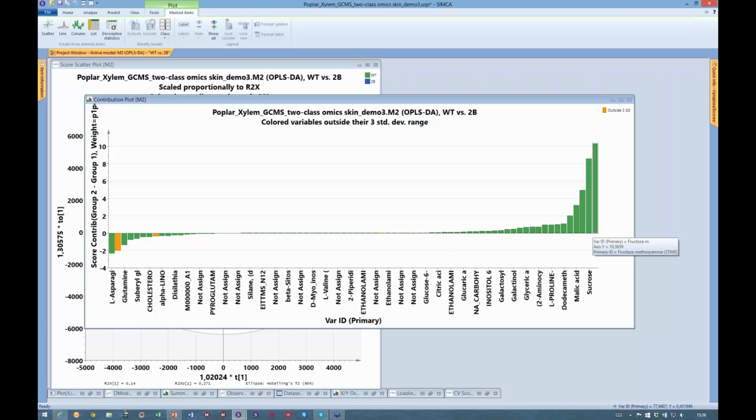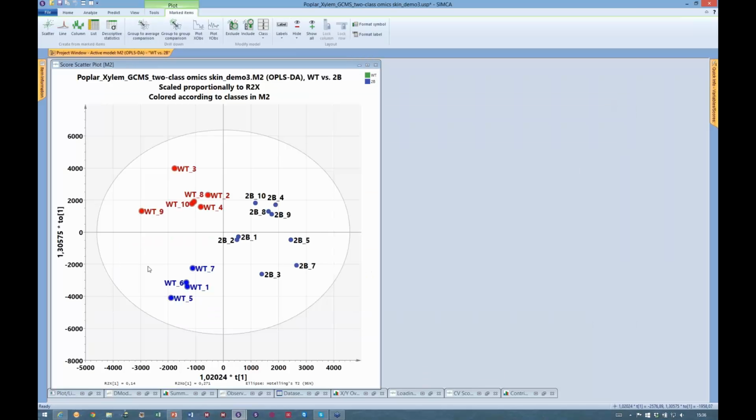So the interpretation is that there might be a sample preparation issue causing the split in the wild type group, and being able to visualize that sort of systematic shift means we now have something to watch out for in the future if we would like to conduct similar experiments in another experimental campaign.